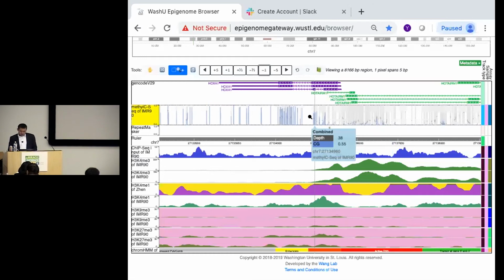Again, all the information is from the same data, but by presenting the data a little bit differently, you actually learn a little bit more. You know the confidence level, and the difference between no data versus 0.